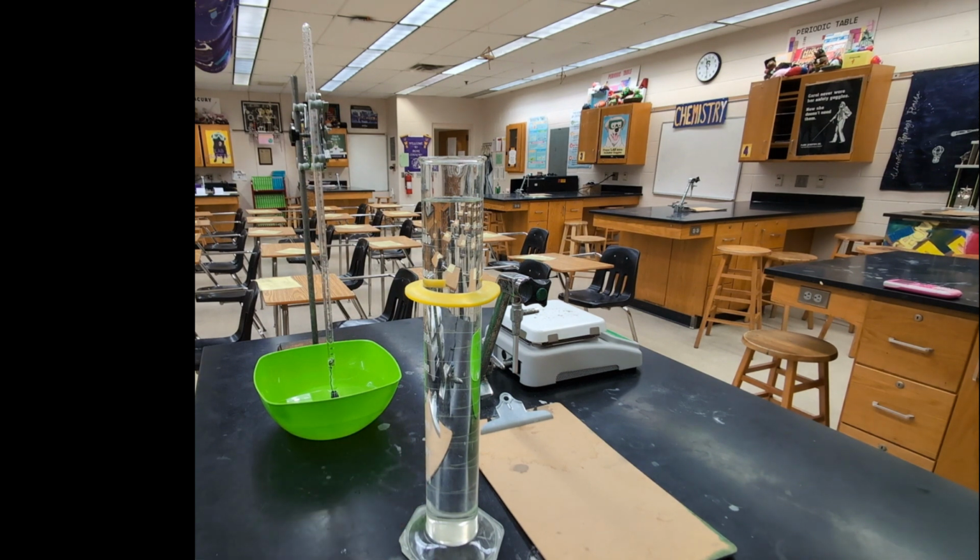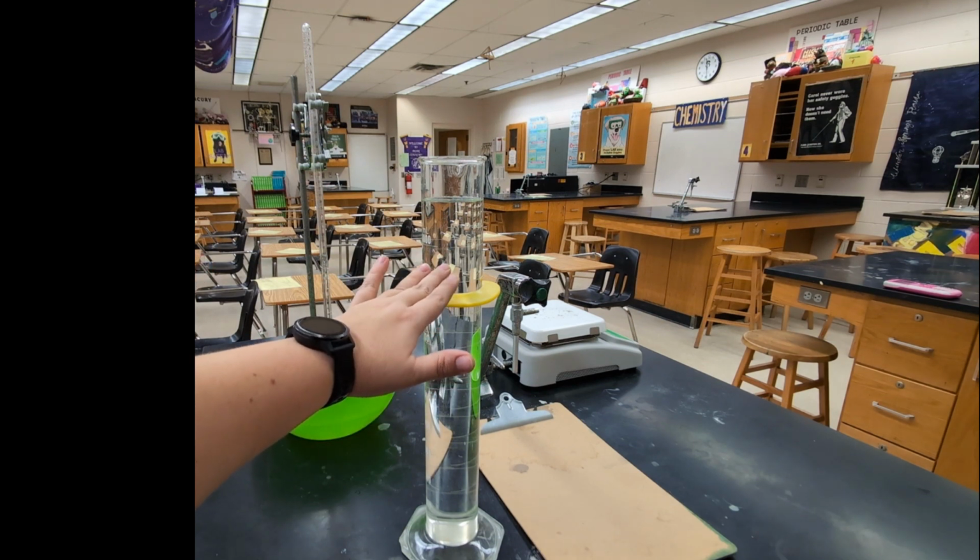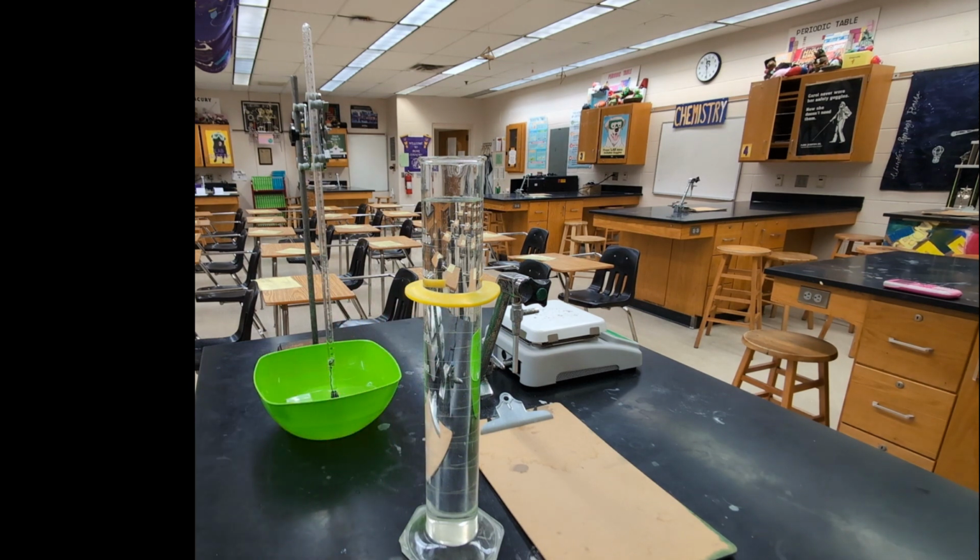The reason why I want to do that is to make sure that the level of the water inside the eudiometer is the same as the level of the water in the graduated cylinder. And the goal of that is to make sure that the pressure that we measured for the atmospheric pressure is the same as the pressure inside the eudiometer. And we can do that by matching the water levels. So let me show you how we do that.